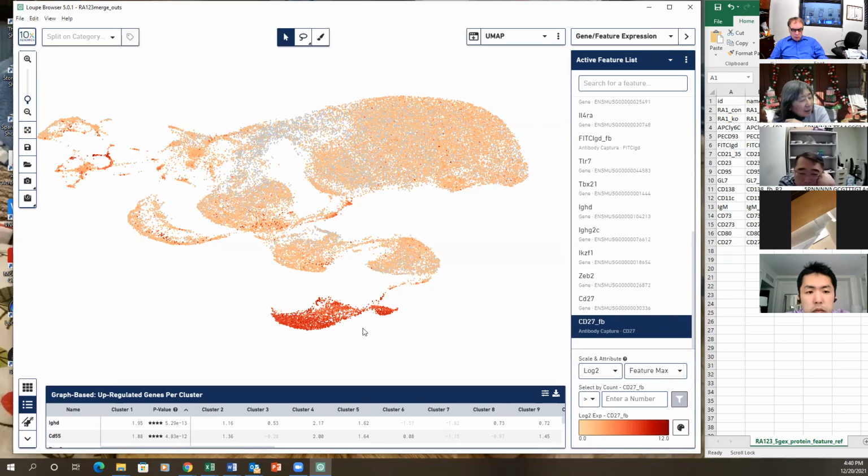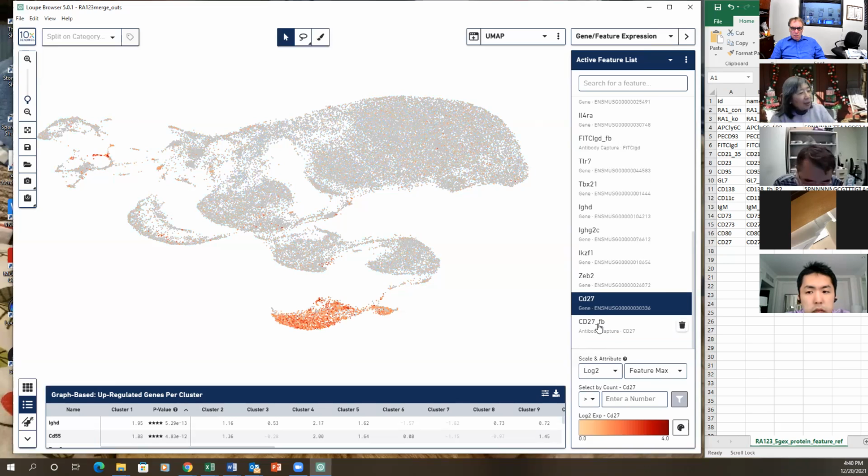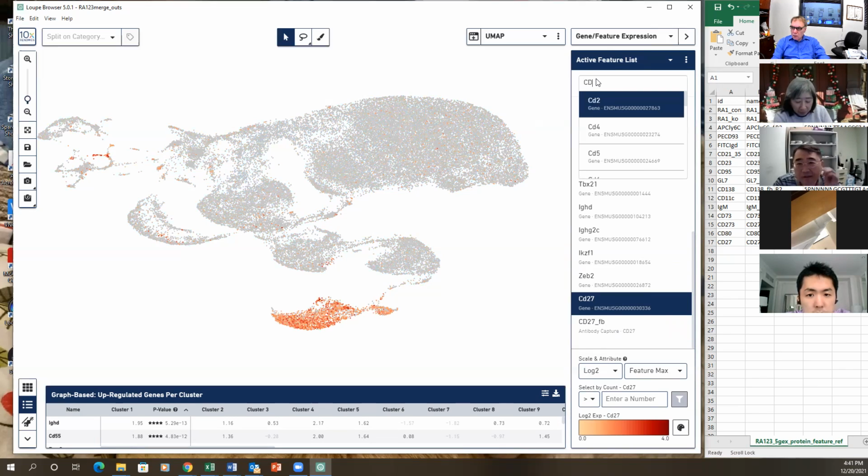Because Shanruns put this antibody, so it's purified. That wasn't the plan. The first plan was using CD27, so we bought the antibody, but later on we changed, but we had the antibody already anyway. That's the reason why we use it. That's amazing. Let's see the other memory markers.